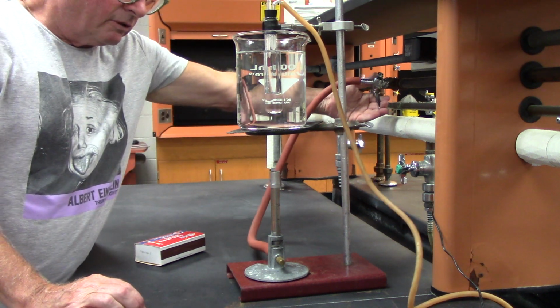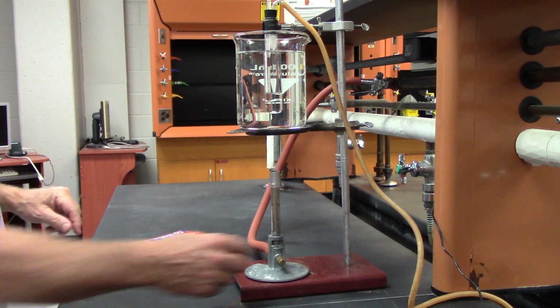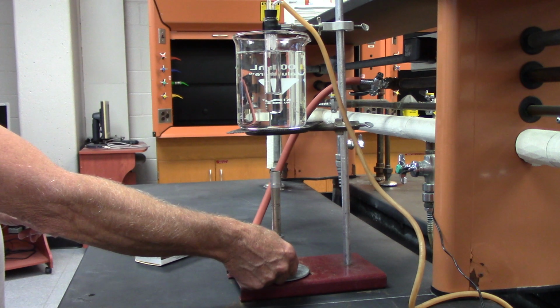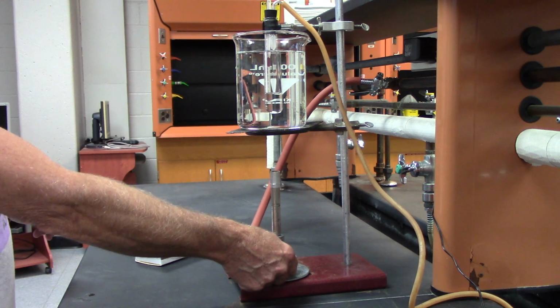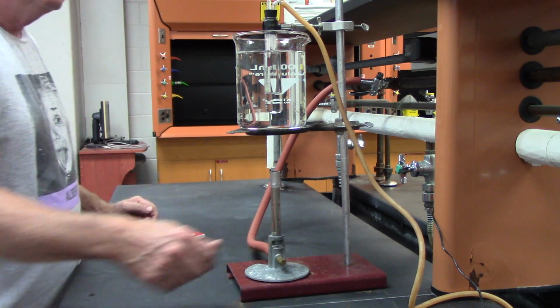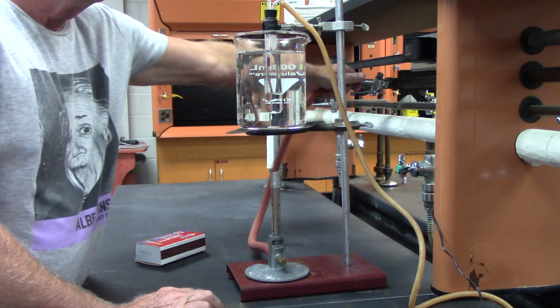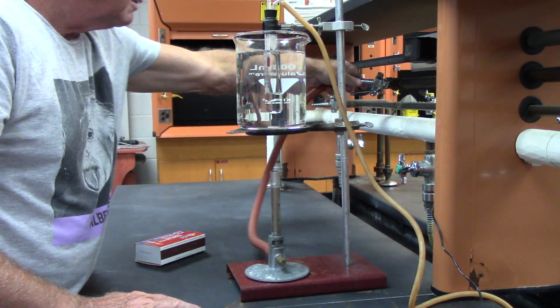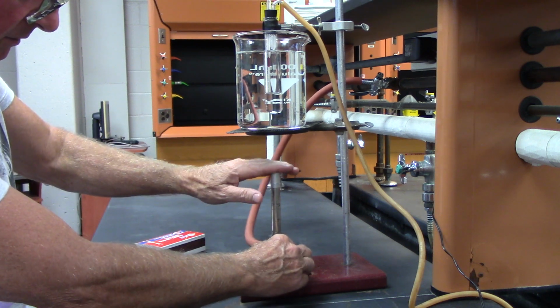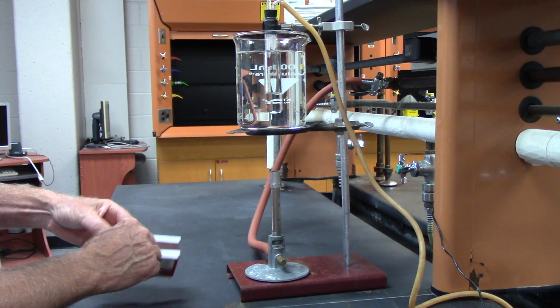First thing I do is turn on the gas input. I have a feeling I'm going to have to change this because this valve doesn't work. Oh, yes, it does. Smell it.